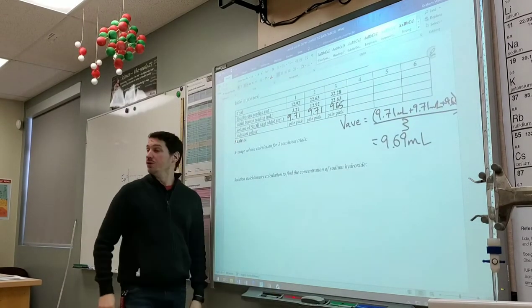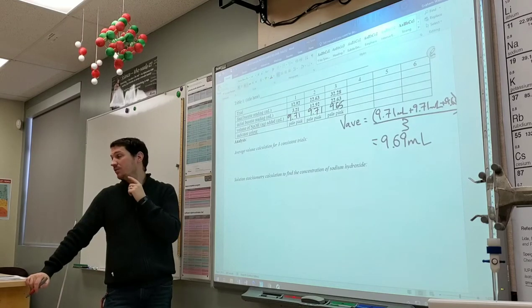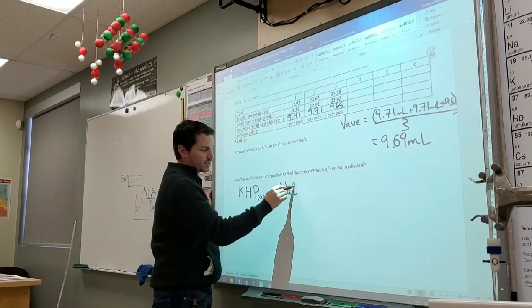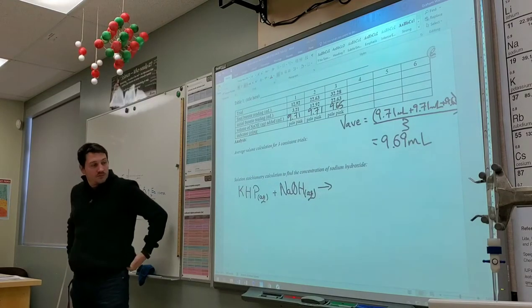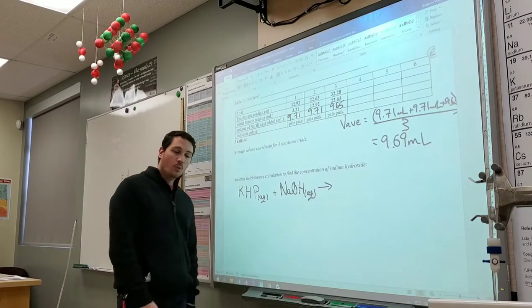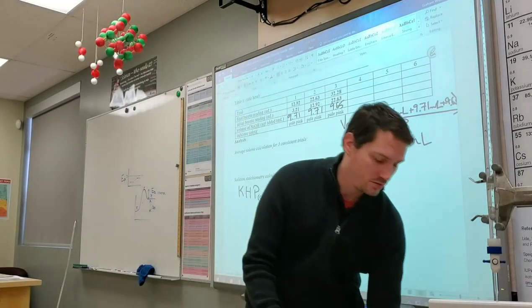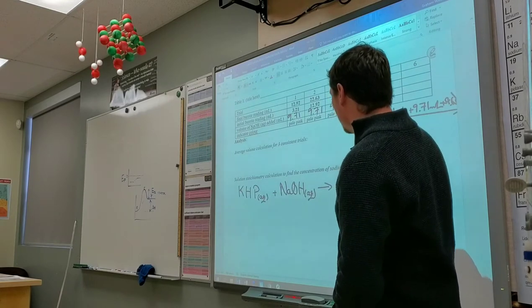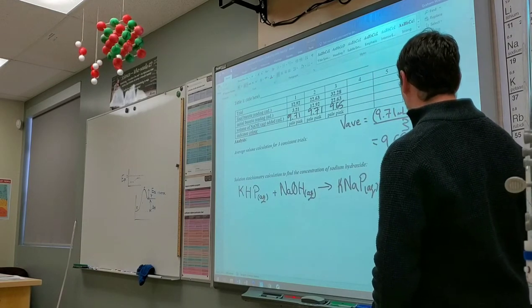So, do you remember what two things we were reacting here? We were reacting our KHP and our sodium hydroxide. Now remember, KHP isn't made up of potassium, hydrogen, and phosphorus. It's just a shorthand. What is the sodium hydroxide going to steal away from the KHP? The hydrogen. It's going to jack that hydrogen. So we're going to end up with potassium sodium phthalate, and we're going to end up with water. Liquid, perfect.